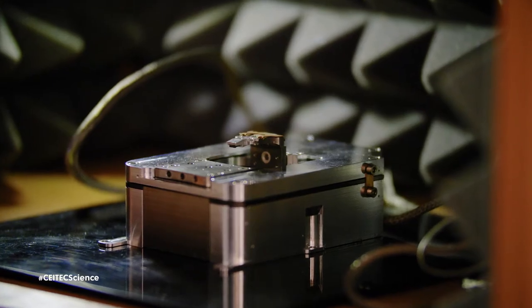LightScope is an atomic force microscope carefully designed for direct integration into scanning electron microscopes.